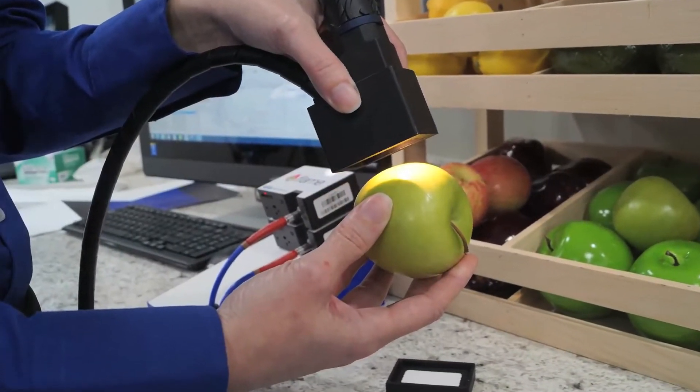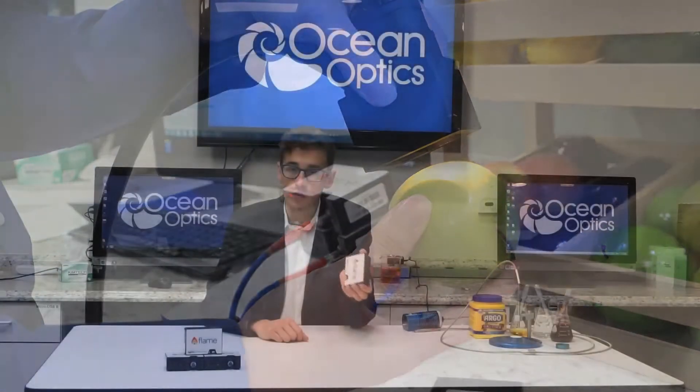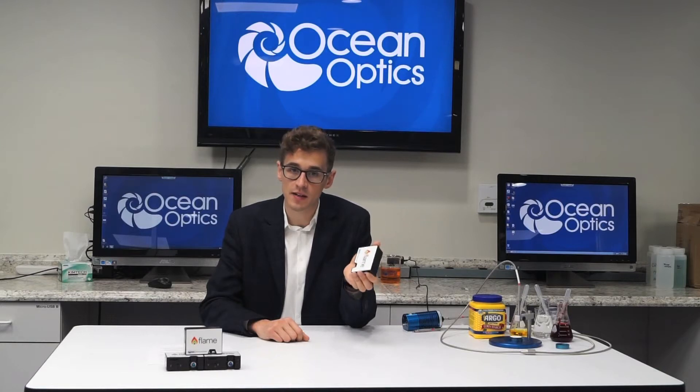While we've made it smaller, we haven't made it less sensitive. Using a high-performance uncooled indium gallium arsenide detector, the FlameEar can take up to 400 scans per second over the USB connection.